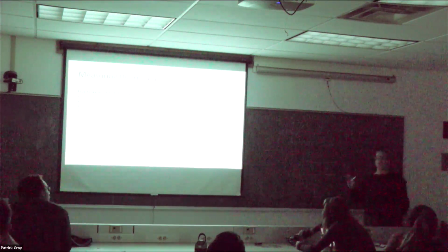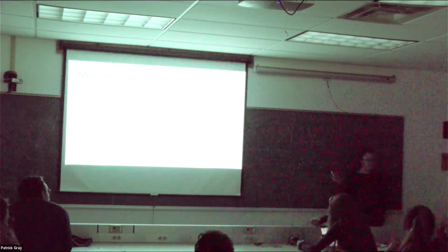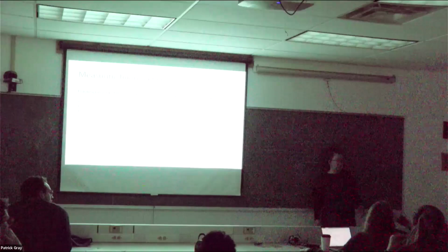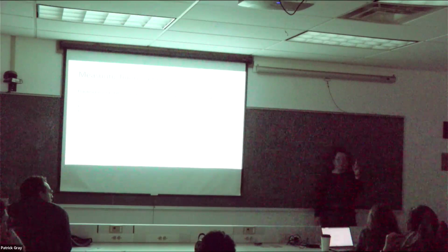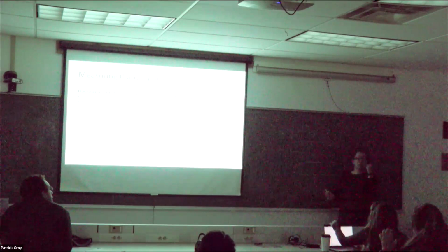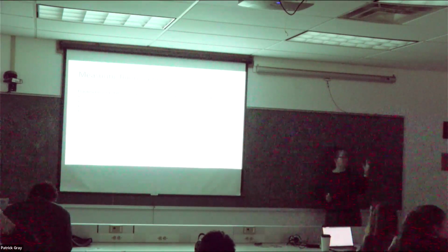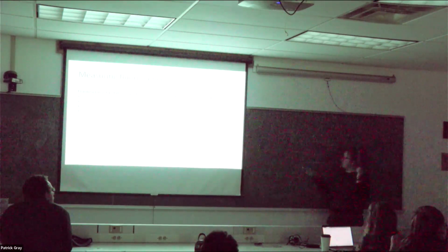Does everybody understand the mechanics of it? What am I doing here? Just mechanics, like an instrument. You're going to go through and start at 400, all the way to 800, and you're always sensing that re-emission at one wavelength. Just one wavelength. You could pick a different wavelength to sense if you were looking at a different re-emission spectrum. Exactly. But each sensor can only detect one wavelength at a time. My detector is really stupid. My detector can measure only one wavelength. Or I'm really interested in what's happening at 685.